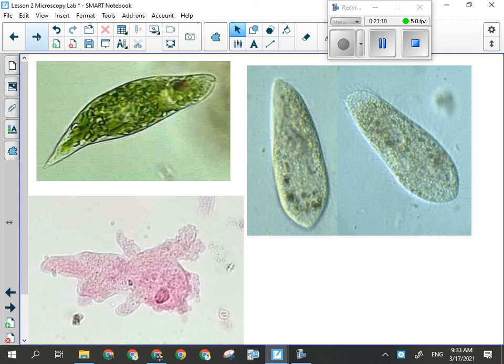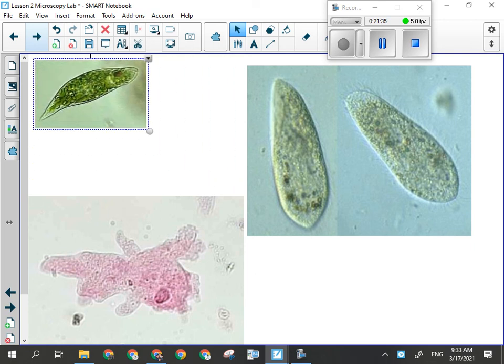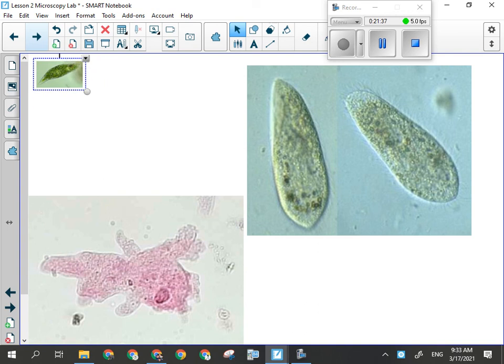All right, the last thing you're going to look at is the Euglena. Now, this is way bigger than you are going to see it. When you look at the Euglena on the scanning power lens, it will be a small faded blue sliver. That's it. They're very, very small. When you get it on low power, it will be a slightly larger pale blue sliver. And when you get it on high power, it will look kind of like this, but more like that. They'll be quite small.